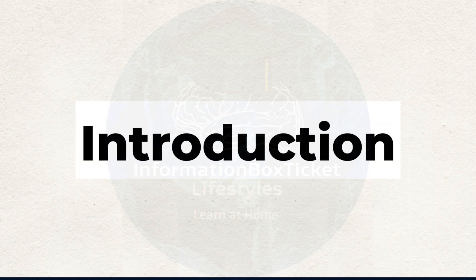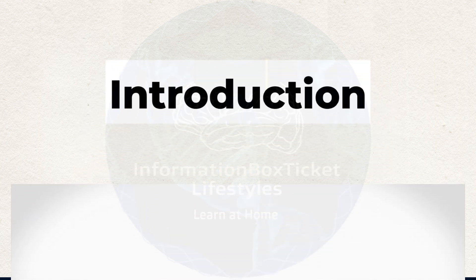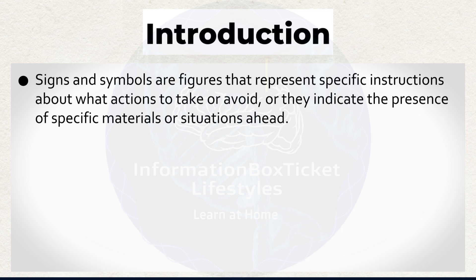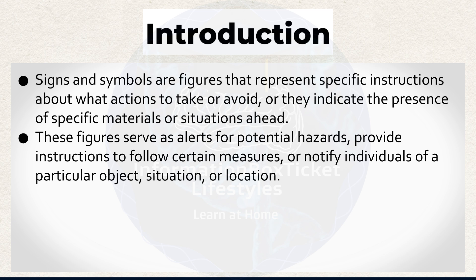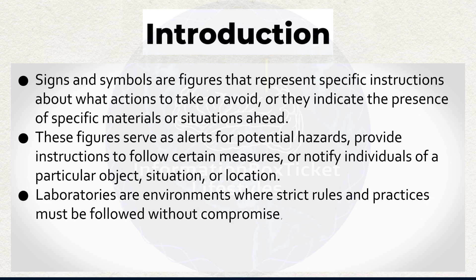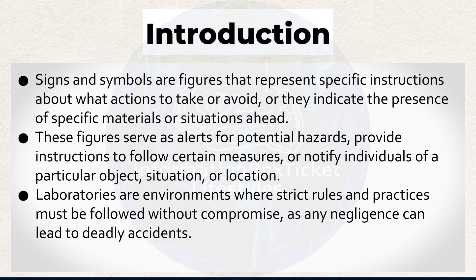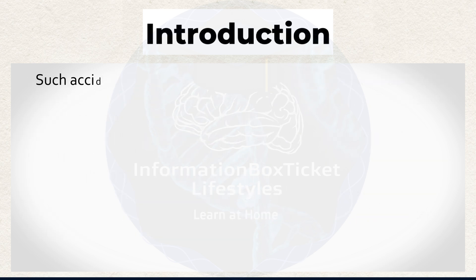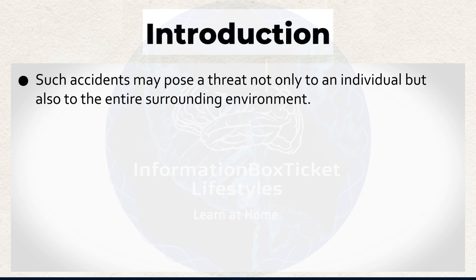Introduction to laboratory safety signs. Signs and symbols are figures that represent specific instructions about what actions to take or avoid, or they indicate the presence of specific materials or situations ahead. These figures serve as alerts for potential hazards, provide instructions to follow certain measures, or notify individuals of a particular object, situation, or location. Laboratories are environments where strict rules and practices must be followed without compromise, as any negligence can lead to deadly accidents. Such accidents may pose a threat not only to an individual, but also to the entire surrounding environment.